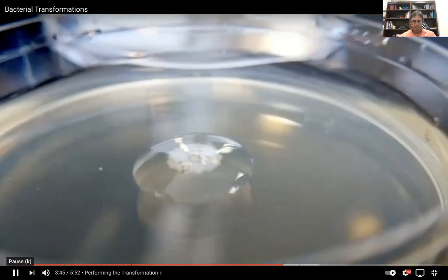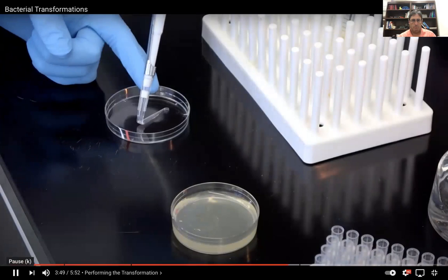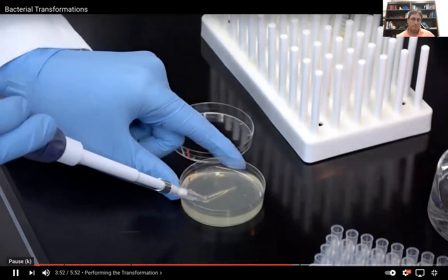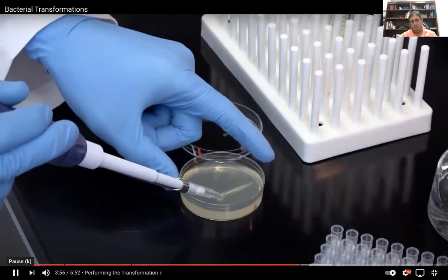Containing the necessary antibiotic. If you use pipette tips that are easy to bend, like ours, you can also use them as spreaders when plating the cells. Notice they did the bending on the upturned inside edge of the plastic, not on the bench, not with their fingers, and more importantly, not on the agar itself. This is a great way to make a plastic hockey stick. When bending the tip, make sure you are using good sterile technique throughout the process.